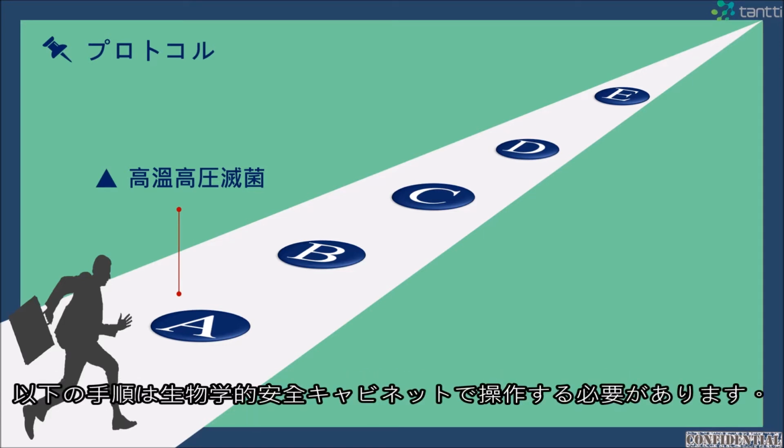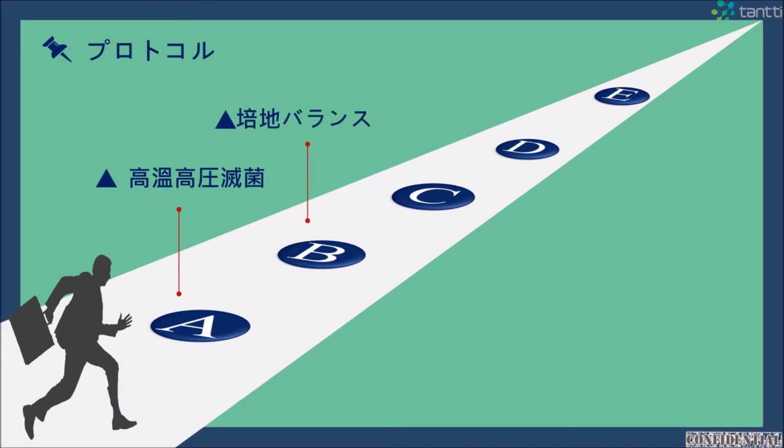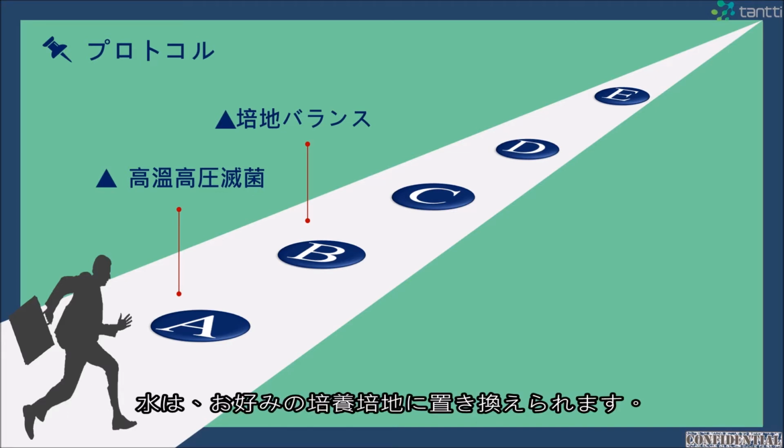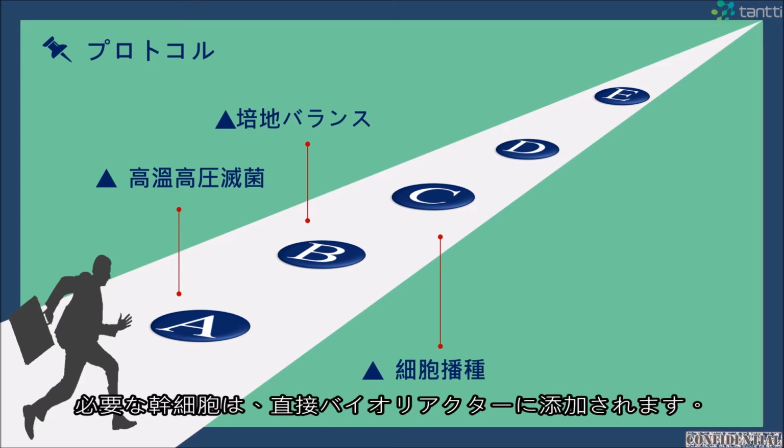The following steps should be operated in a biological safety cabinet. Second, culture medium equilibration. Water is replaced with your desired culture medium. Third, cell seeding. The required stem cells are directly added to the bioreactor.